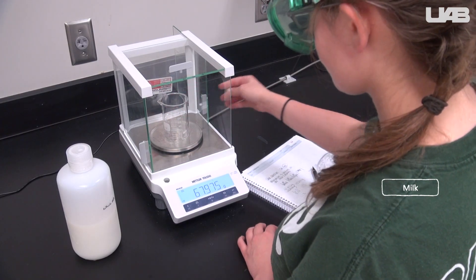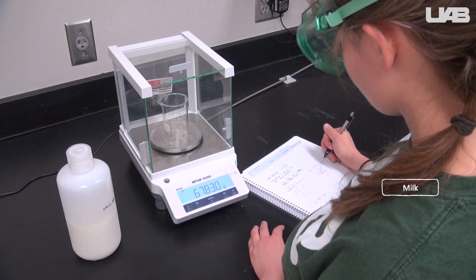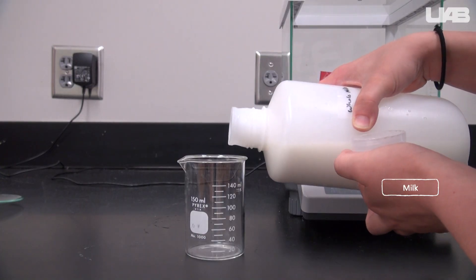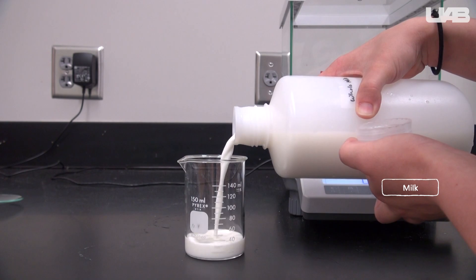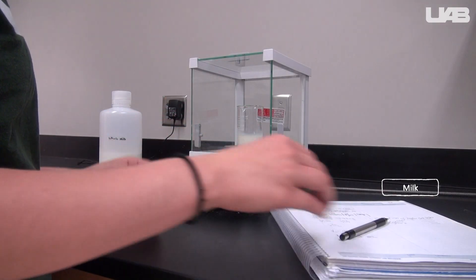So first we need to actually get our milk. Determine the mass of the empty beaker and record it in your notebook. Take the beaker off of the balance and pour in about 50 milliliters of milk into the beaker and record the mass of both. It should be about 50 grams.